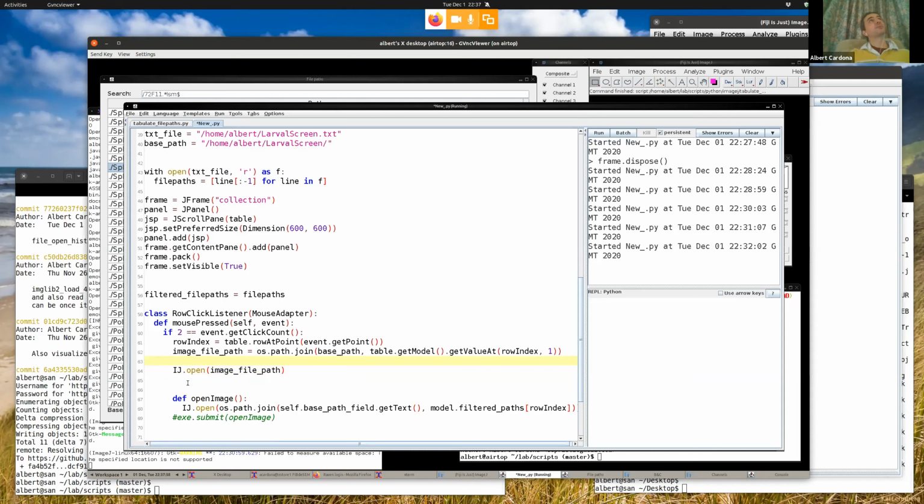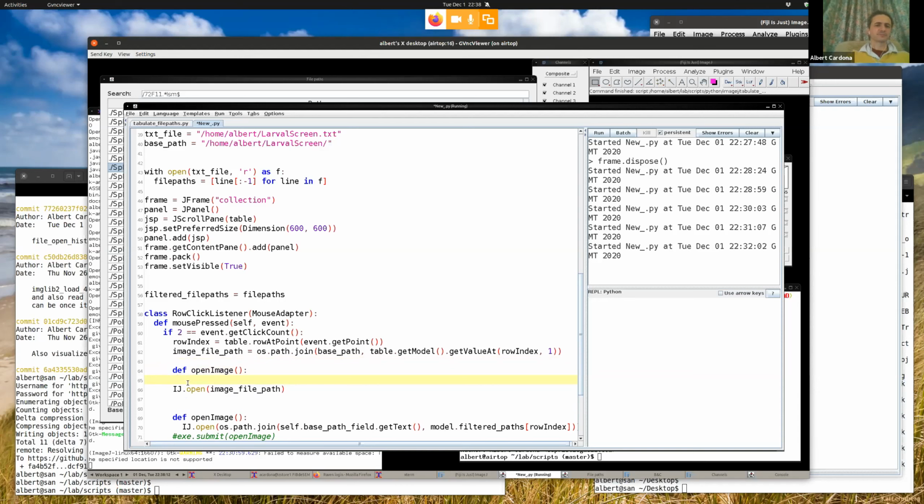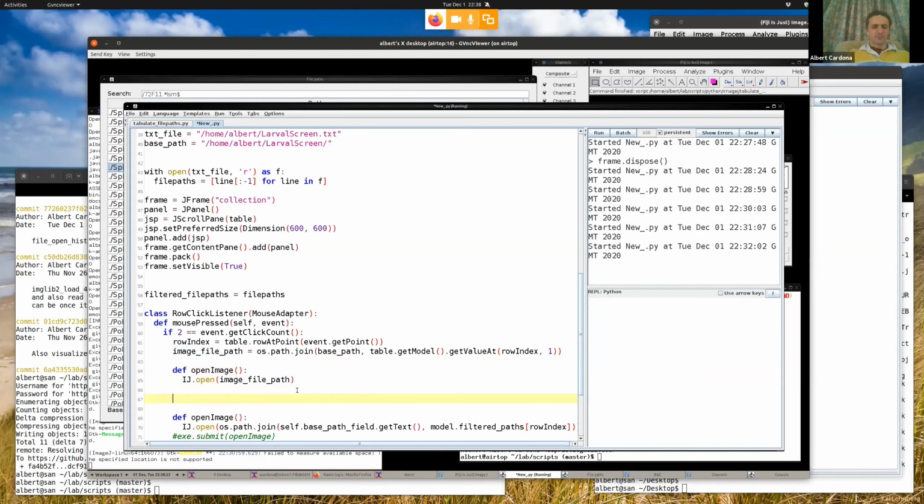And to do that properly, I need to define, so all functions in Python define the runnable interface that threads can execute. If this is a bit too much, listen for a moment. So we define a new function, and this new function will do the job for us. And it will read this variable, which is here in its own scope, so we can read it. And then now what we do is we say, okay, let's create a new thread.